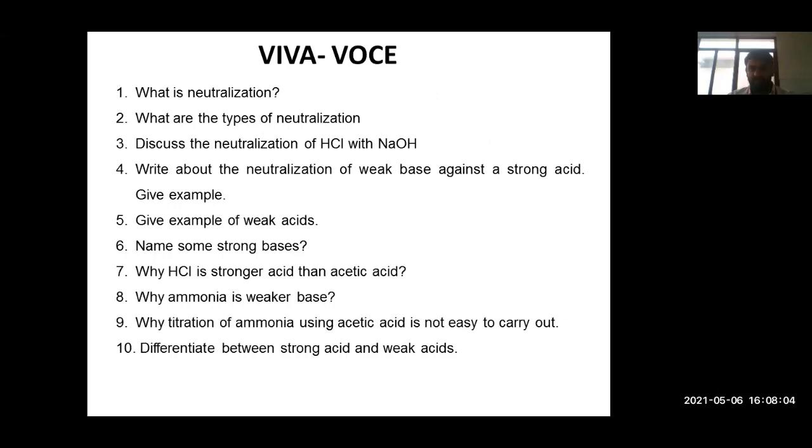These are the questions for viva voce. We will discuss this in the practical demonstration.